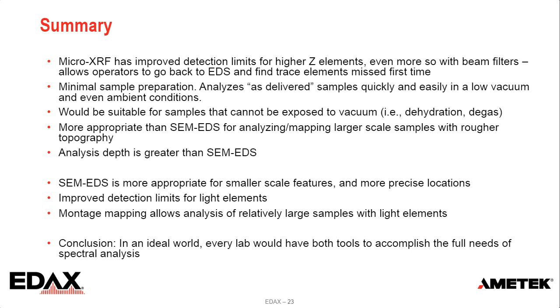Next question is, what are the maximum kVs for EDS and micro-XRF? The typical maximum kV for SEM-EDS is 30 kV, and for micro-XRF, it is 50 kV.